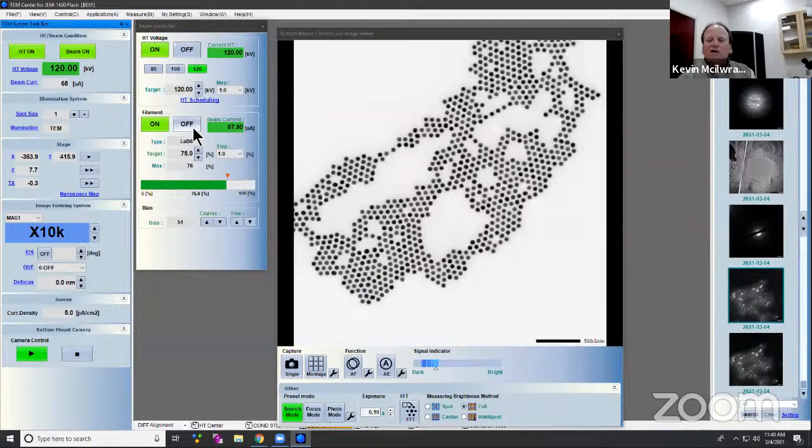So the stages are great, and they're getting better and better. It was software to compensate for what's going on. If you saw that Axon video at the end of my presentation, when you're doing in situ work, things are heating, cooling, moving, and all these things are going on. But software now and cameras are high speed enough that they can compensate for that issue.